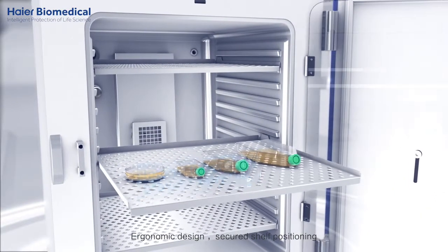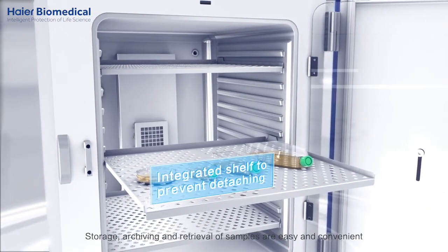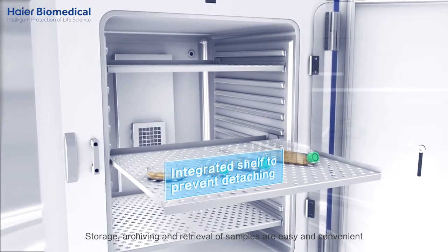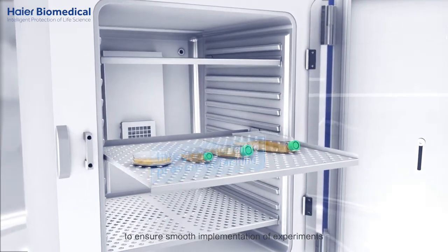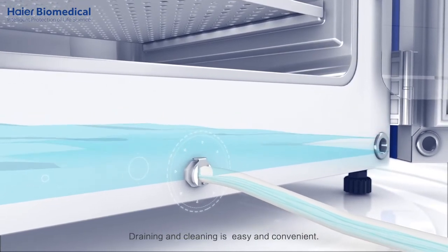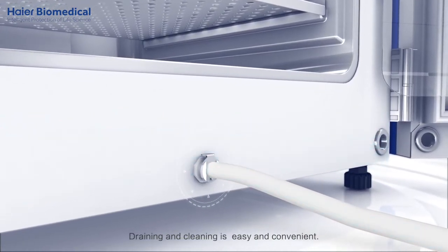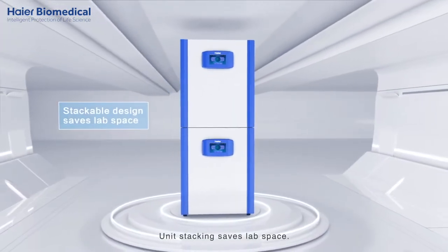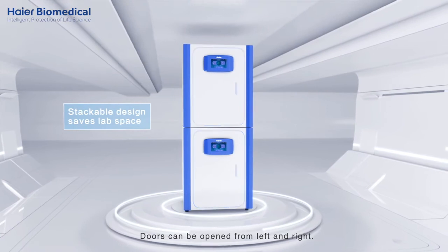Ergonomic design with secured shelf positioning. Storage, archiving, and retrieval of samples are easy and convenient to ensure smooth implementation of experiments. Draining and cleaning is easy and convenient. Unit stacking saves lab space, and doors can be opened from left and right.